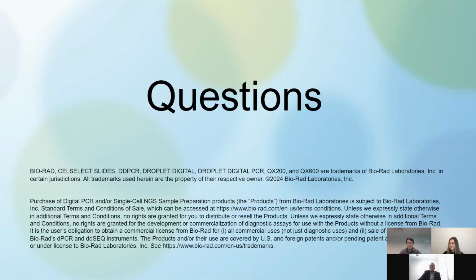Thank you. Great. All right, another question for Dr. Kang here. Since CTCs are very rare in circulation, how do the different single cell isolation methods compare with regard to capture efficiency? Also, how do the methods compare with regard to their gentleness of cells during the process? For example, are any methods better at preserving the native biology of the individual cells, which is essential for examining gene expression?